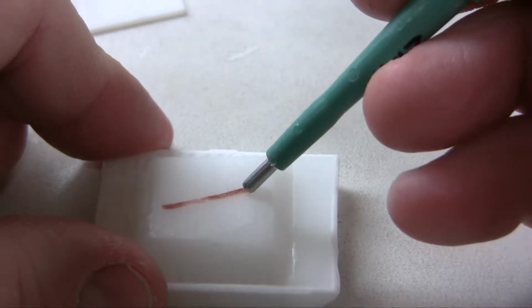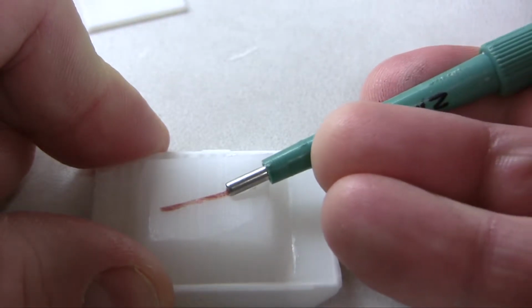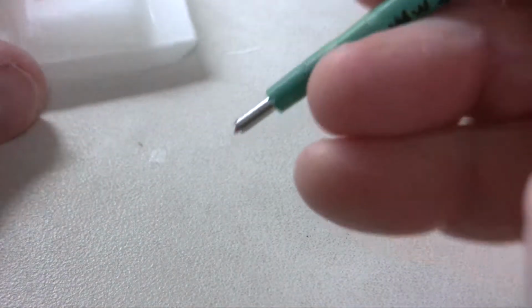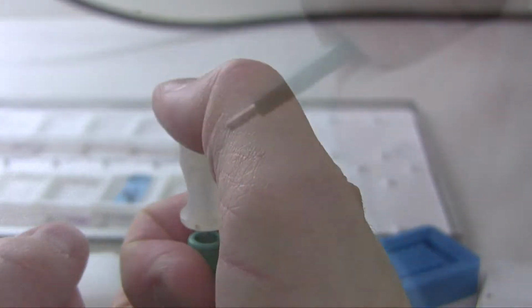In the past, technicians would do a double or triple punch to fill a needle. This type of technique creates sporadic tissue throughout the core. When that TMA is cut, these cores will pop out, causing blank spots in the TMA. It's best to fill the needle, then pack it. This will create a solid core, also called a sausage core.